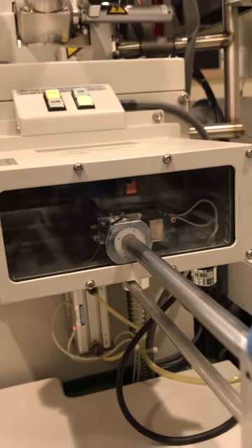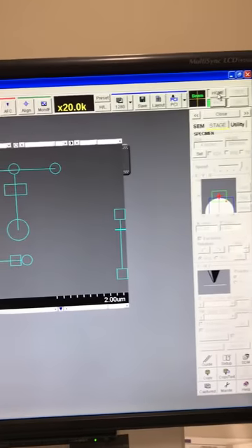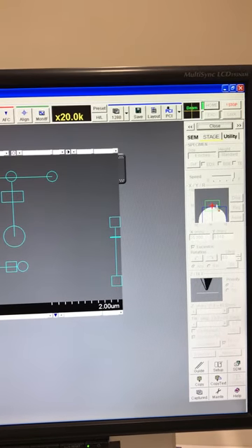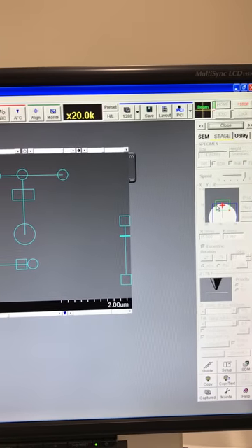Unlock the rod and pull it back — the sample now stays inside. Close the door. On the screen, press the Home button and the sample will move to exactly the center of the screen. That's how you load your sample into the microscope.